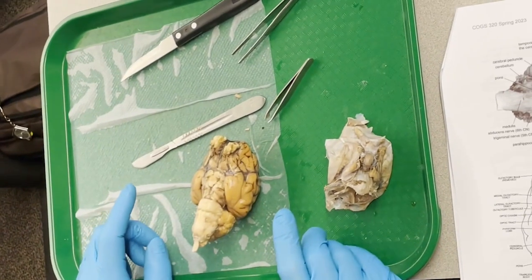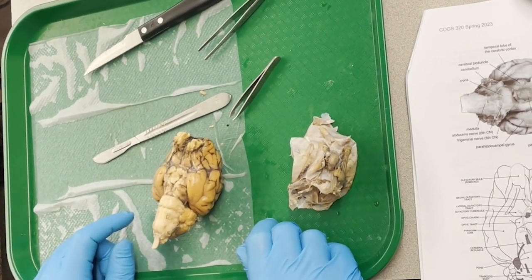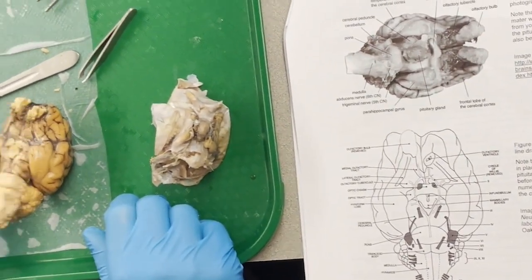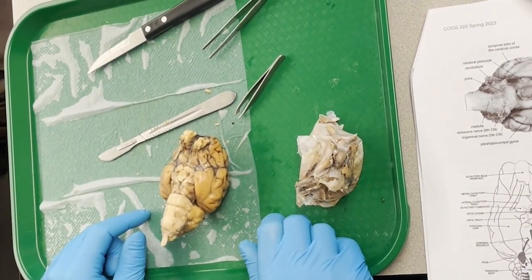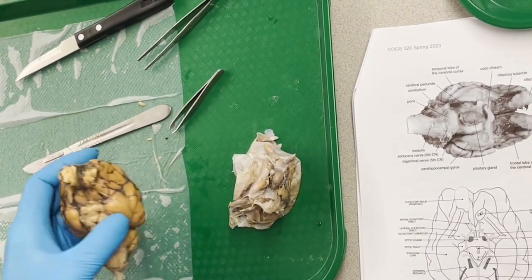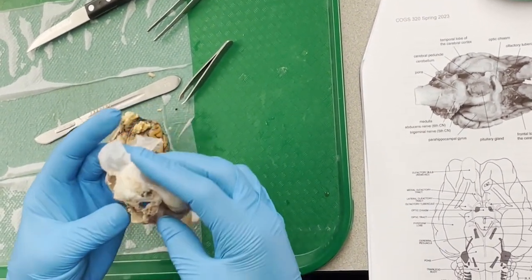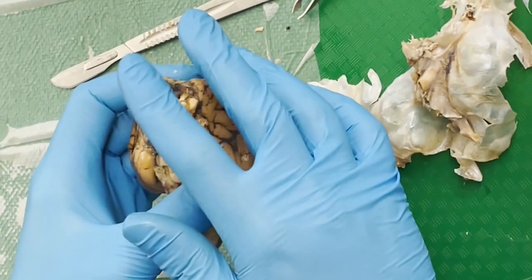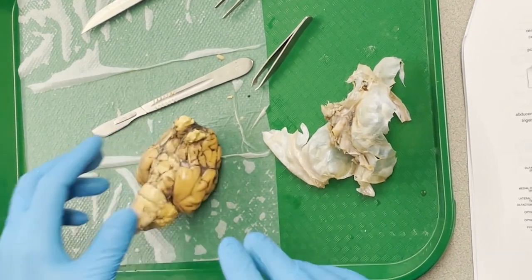So if this is cranial nerve 2, what do you think cranial nerve 1 would be? You might get some hints from the picture that the numbering of nerves is based on how far back they appear in the brain. So as you go down, the nerve numbers get larger. So that means that the cranial nerve 1 would be more forward. Yes? The olfactory nerve. Olfactory nerve, absolutely. So the olfactory nerve, again, might be attached to the dura. I don't know if it's on my specimen, but it would basically be these sort of lighter colored flaps toward the very front of the brain if you have them intact. So olfactory nerve connects to olfactory bulb.